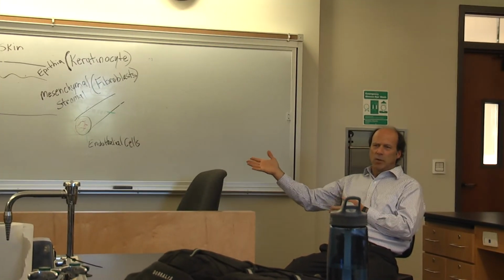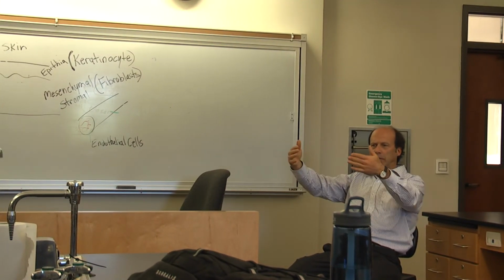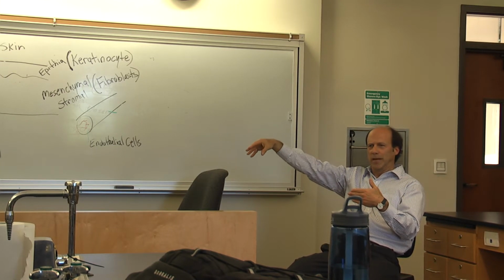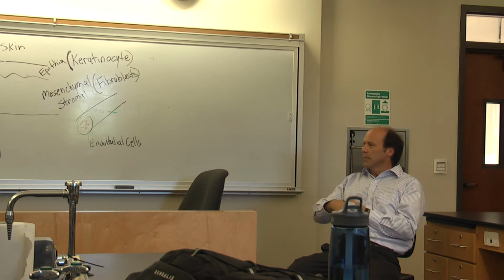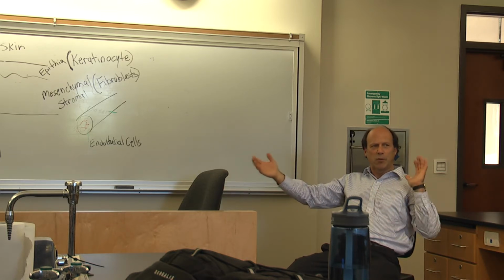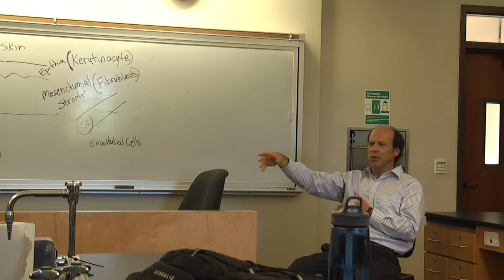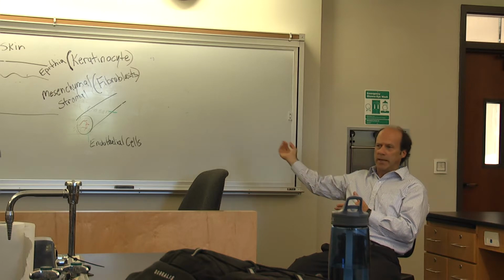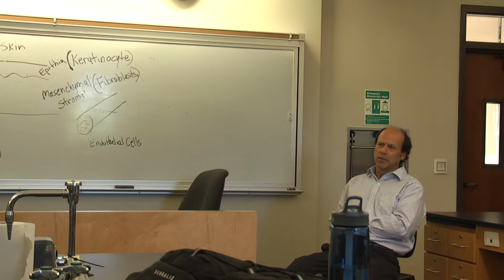And so in our lab, even though it's a small lab, there's the outside door, but there's also a door that empties into the next door lab. And it's there for fire. That's the only reason. So you're allowed to walk through that door. If you had to quickly evacuate our lab room, you could walk through that door to the next door lab, and then exit through that exit door. So there are two exits.